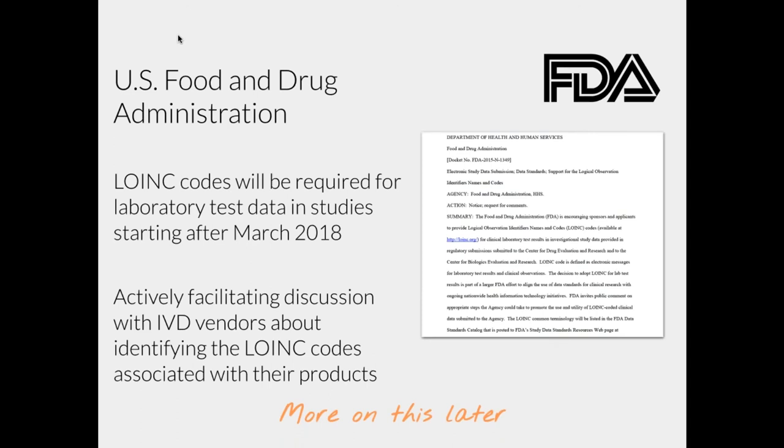We're going to talk more about this tomorrow, but there's been a great deal of interest and support from the FDA in trying to advance lab test data interoperability. One part of FDA has noted that LOINC will be required as the identifier for laboratory tests in clinical trials reported to FDA starting after March 2018. So in the clinical trial realm, this is an important advancement for interoperability, and is part of the reason why some of you are tuning in today to learn more about LOINC.